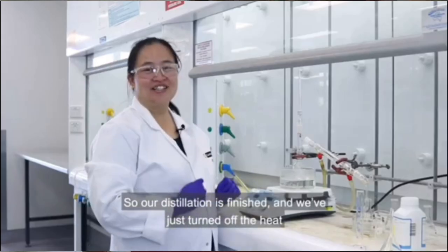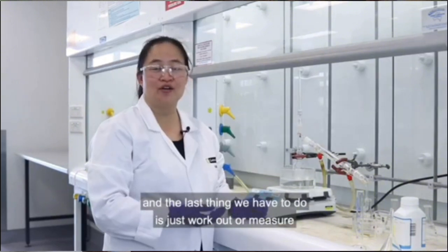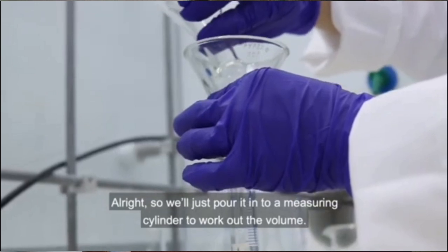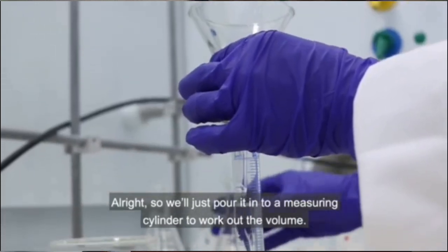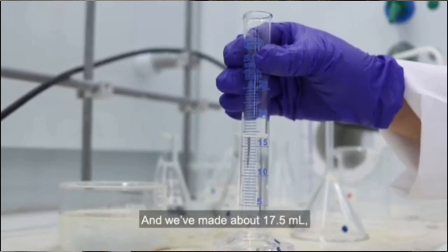So our distillation's finished and we've just turned off the heat. All we have to do is work out or measure how much of the product we made in a measuring cylinder to work out the volume. About 17.5 mils.